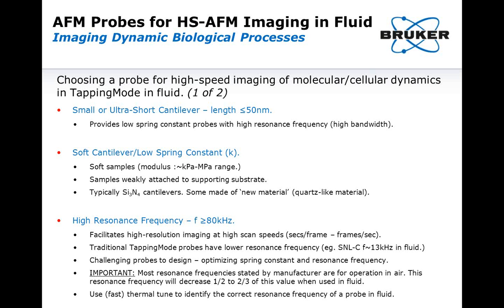This combination of mechanical properties produces probes with a high bandwidth that are soft enough so as not to damage the soft samples or samples that are weakly bound to supporting substrates, and to be able to do so at high scan speeds. It is important to note here that the resonant frequencies quoted by manufacturers is the resonant frequency in air and not in fluid.